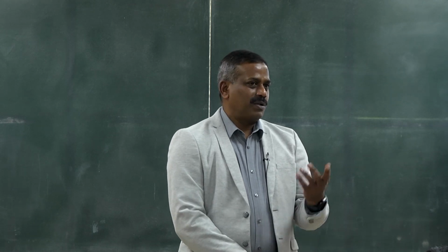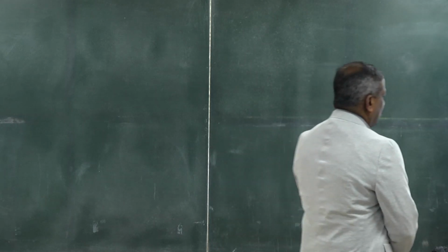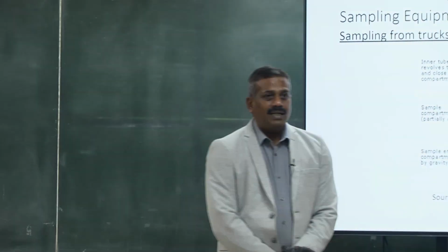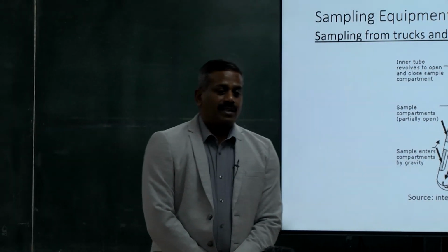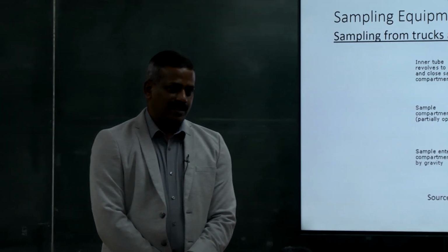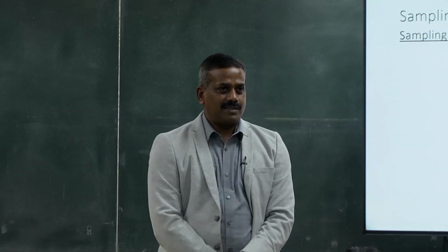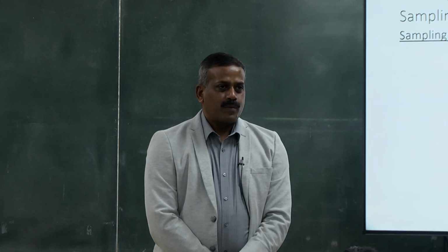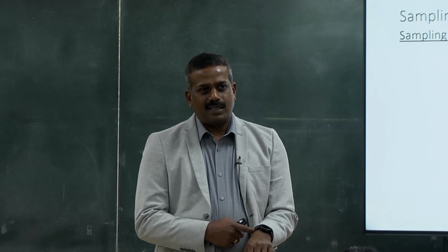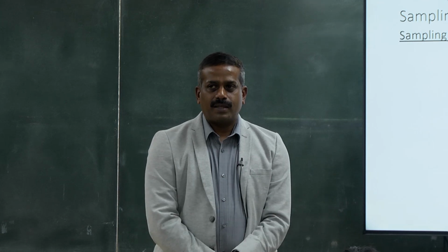So if you are vertical, mostly if you have lots of impurities, then vertical immersion of this probe will be very challenging. So it goes a little slanting. And this is for one system, 10 degrees, it's not always fixed. It depends on the type of grain, type of material, etc. Okay, good. Any other questions?